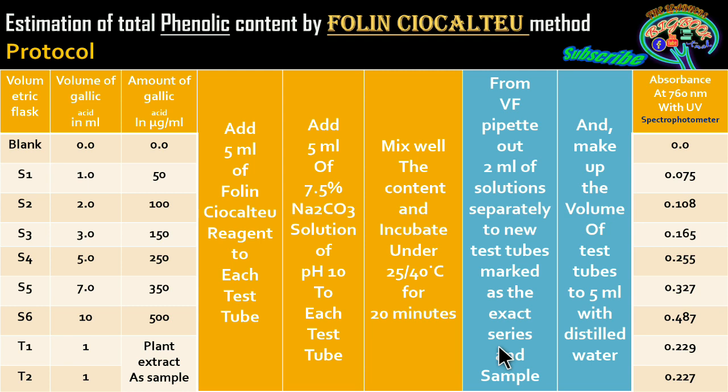So it all depends on you, you can even take less volume, so that you can make the experiment very simple. But here we have done this, so we are discussing the same. Further, you are going to make up the volume of the test tubes to 5 ml with distilled water.